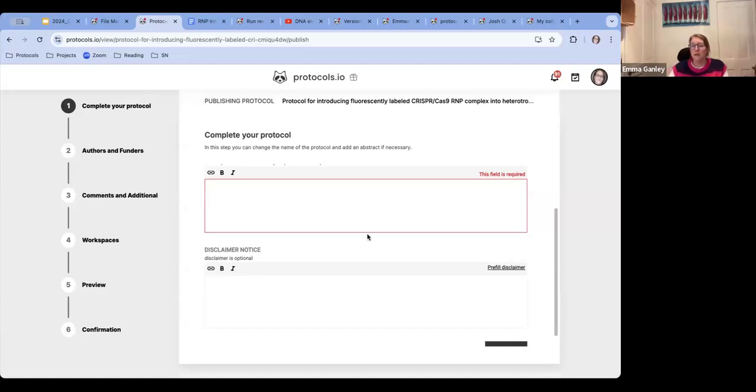And it's a bit like posting a preprint. If you don't have a paid account, we will screen before it goes live. If you are someone with an institutional account, it will happen automatically and it will get a DOI.